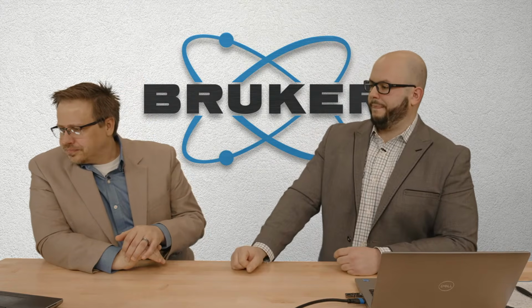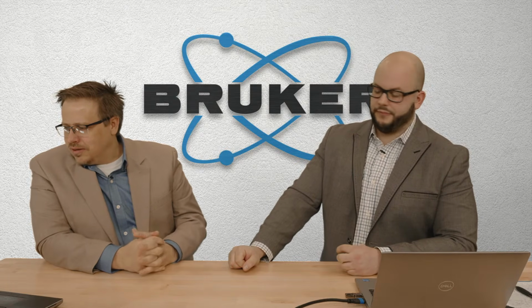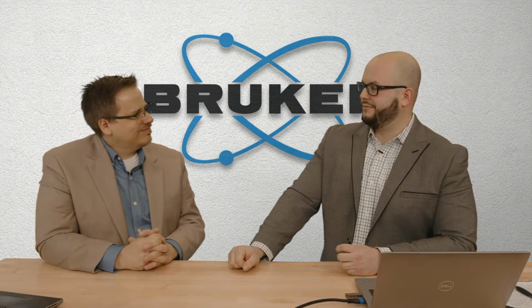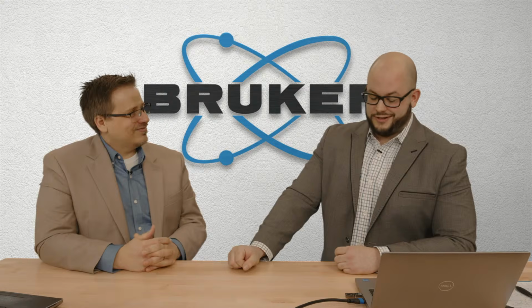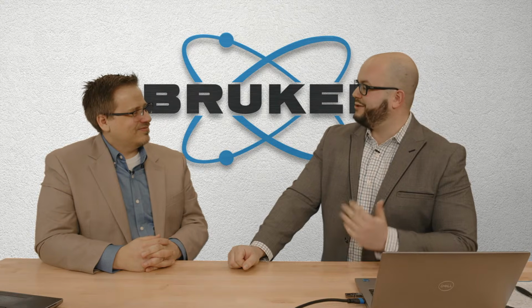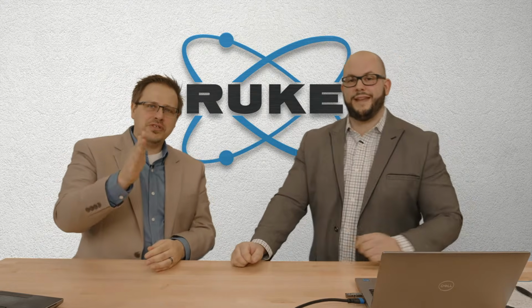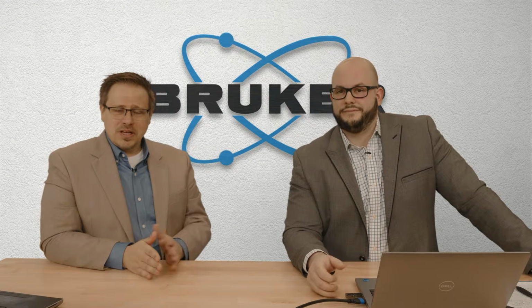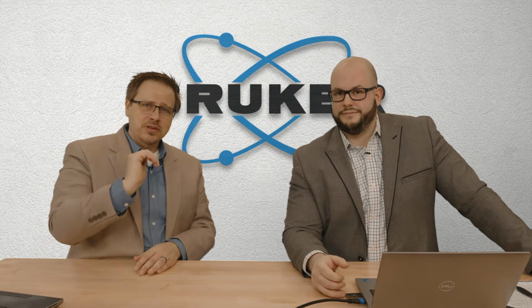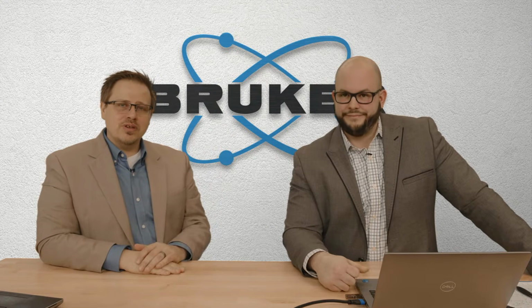All right. Then from Gopal, the question is, how do I make the method? So again, you just kind of go into our software, and the wizard walks you through all the different steps. Here we use that mantra: plan, measure, analyze. For the planning, go into Commander, and in there you're going to have a tab called Wizard. File, new, stress, and that'll walk you right through it.